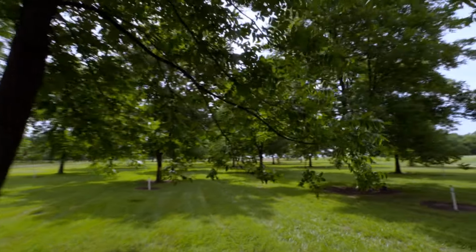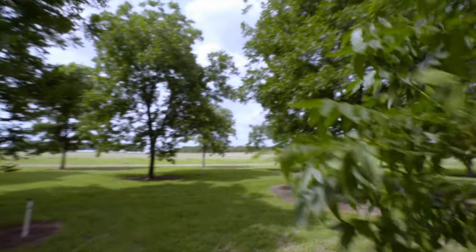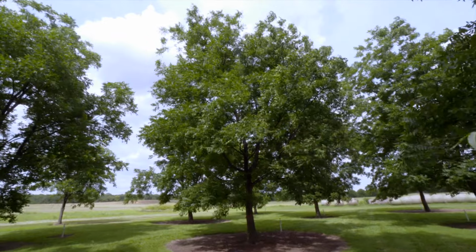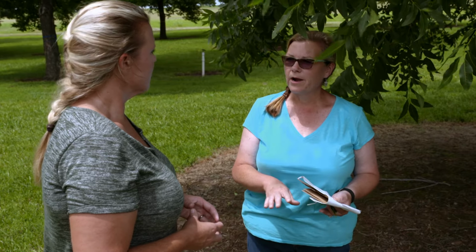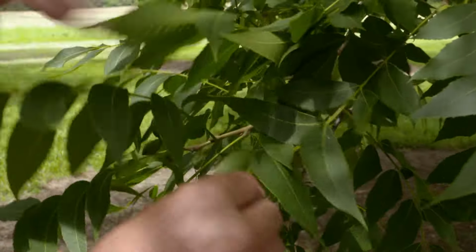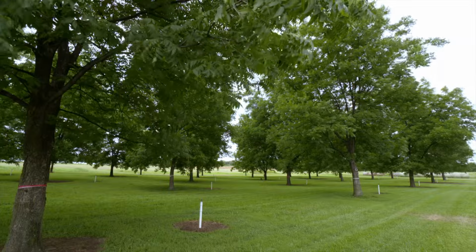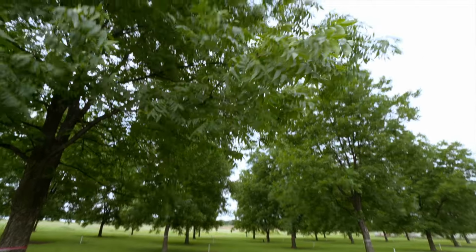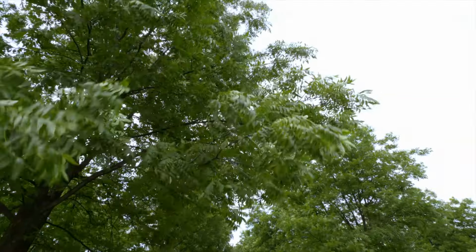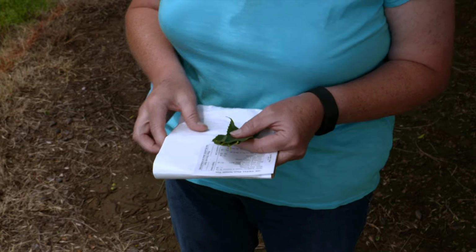On our leaf samples, we want to sample native trees separately from improved varieties, and anything that we manage differently from one area to another, maybe a different soil type or a different area on the farm, maybe upland versus a lower area. Those would be sampled separately. If you're a homeowner, collect 100 leaflets off of your tree or trees. A commercial grower on a big pecan operation would probably collect several samples, making a pattern across their orchard and collecting leaves as they go.